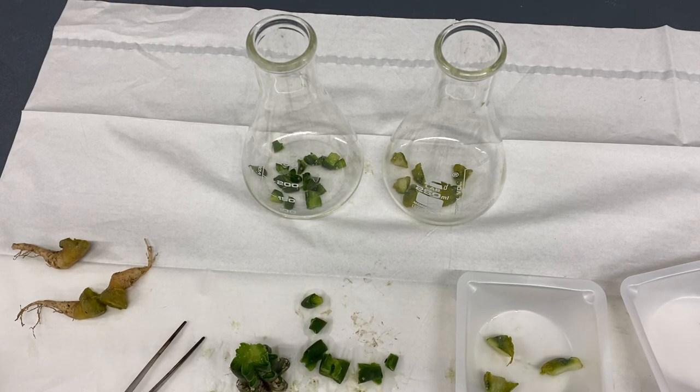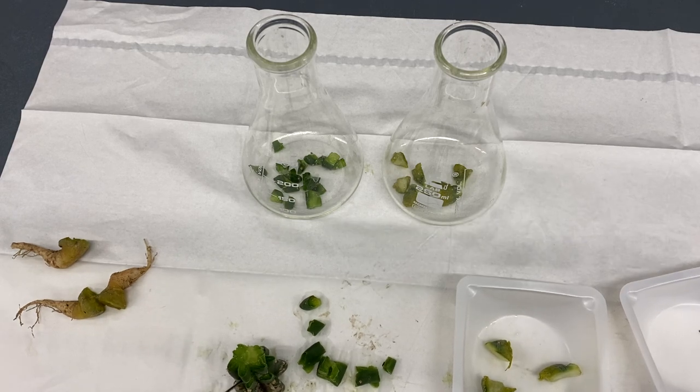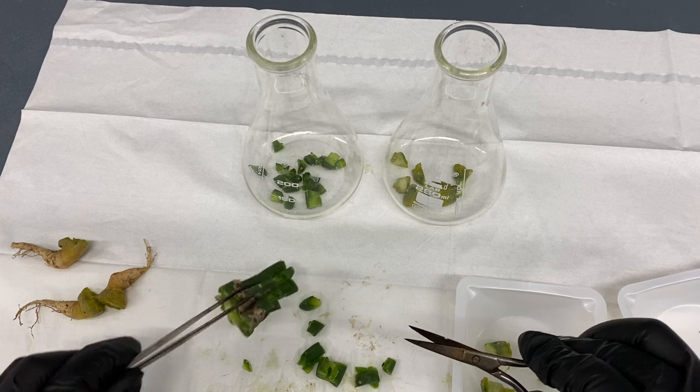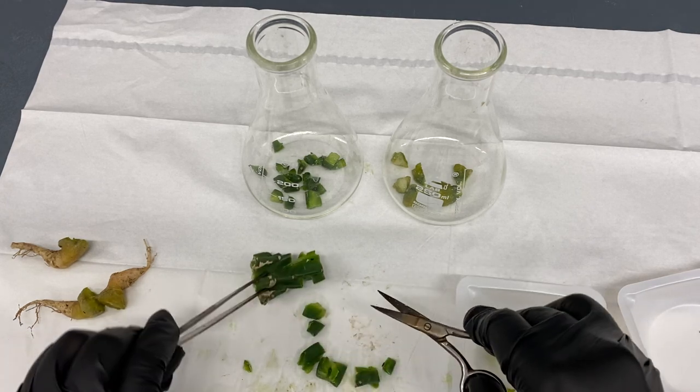I thought I was filming but I wasn't, so I'm going to give you a little breakdown of what I was doing. I wanted to show how to process a columnar cactus.